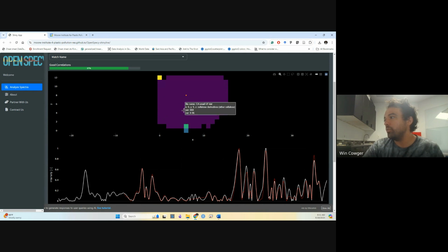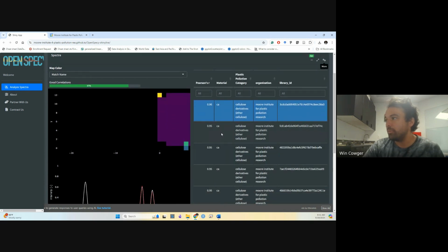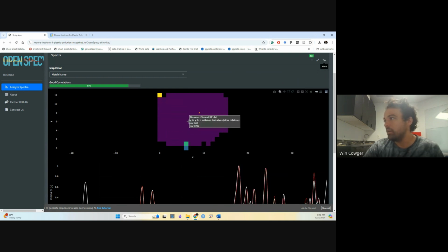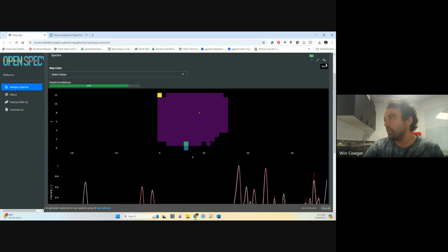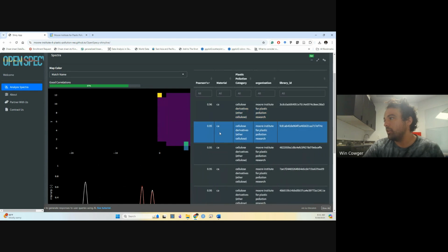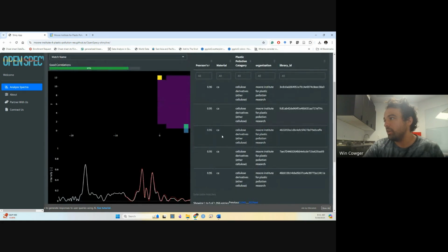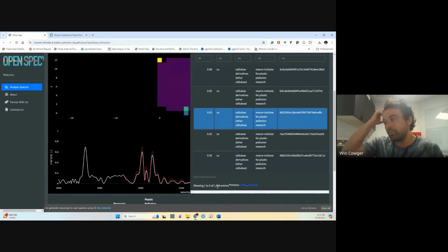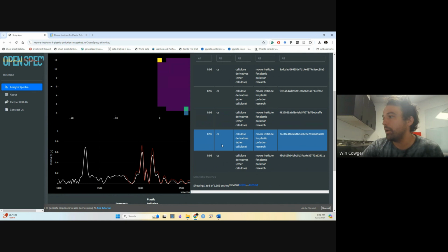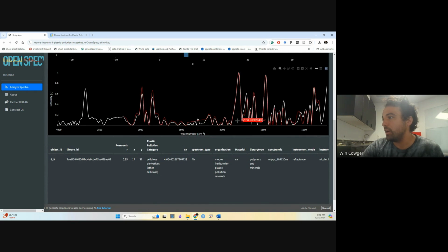Again, just for everybody's memory, we can look at the top matches of every spectrum. So if you didn't like this match very much, you could look at the top matches by pulling this up here, and you could click through them and see the other identities, like the top 5. I think it goes up to about 2,000 spectra in this smaller version of the library. And you can click through them and just compare those visually to the match that you have here.